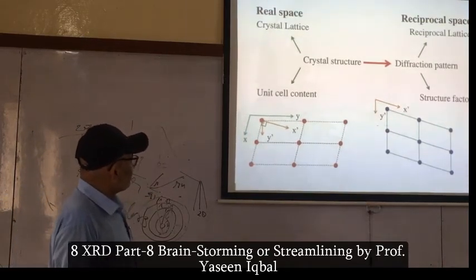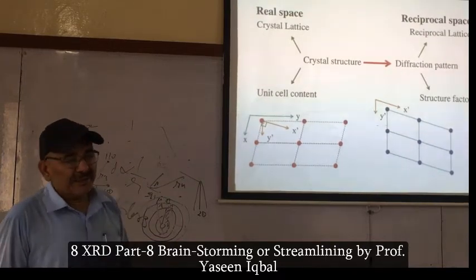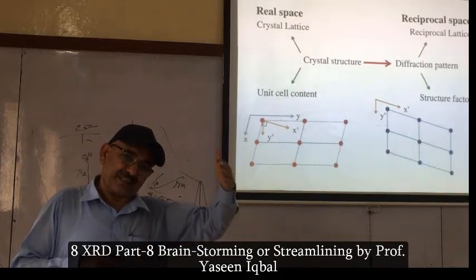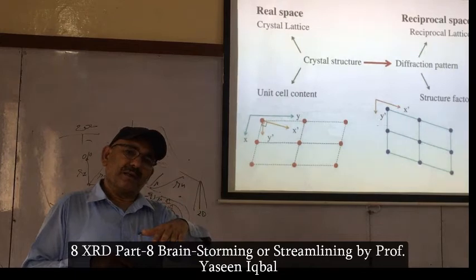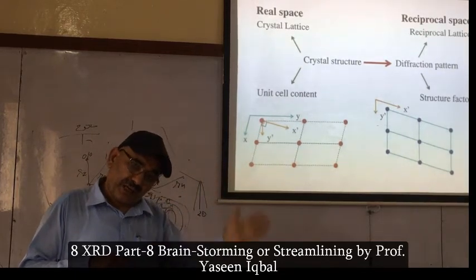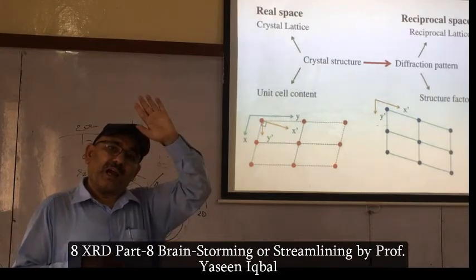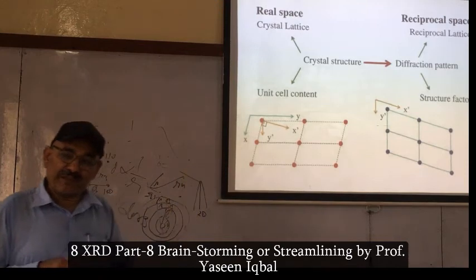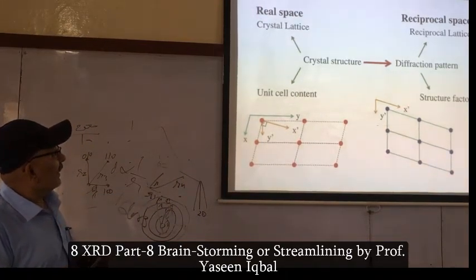So my aim was to tell you that shorter distances, interplanar spacings will be larger. Shorter in the real will be larger in the reciprocal, and larger in the reciprocal means shorter in the real. So they will be reciprocated.